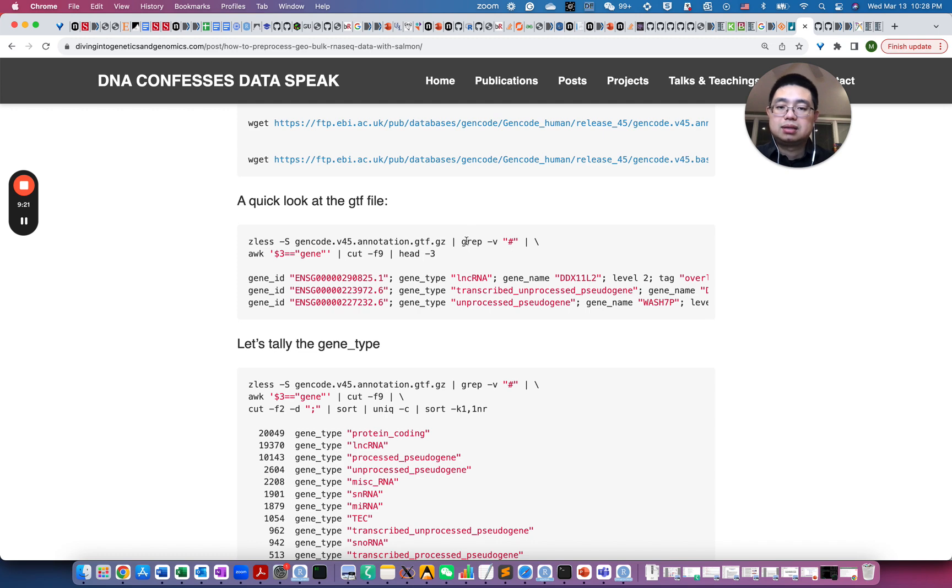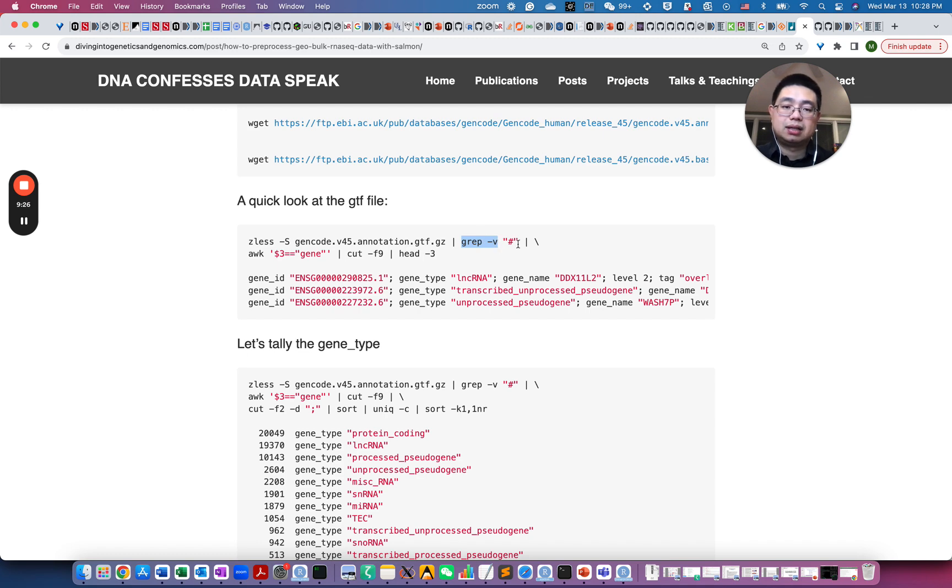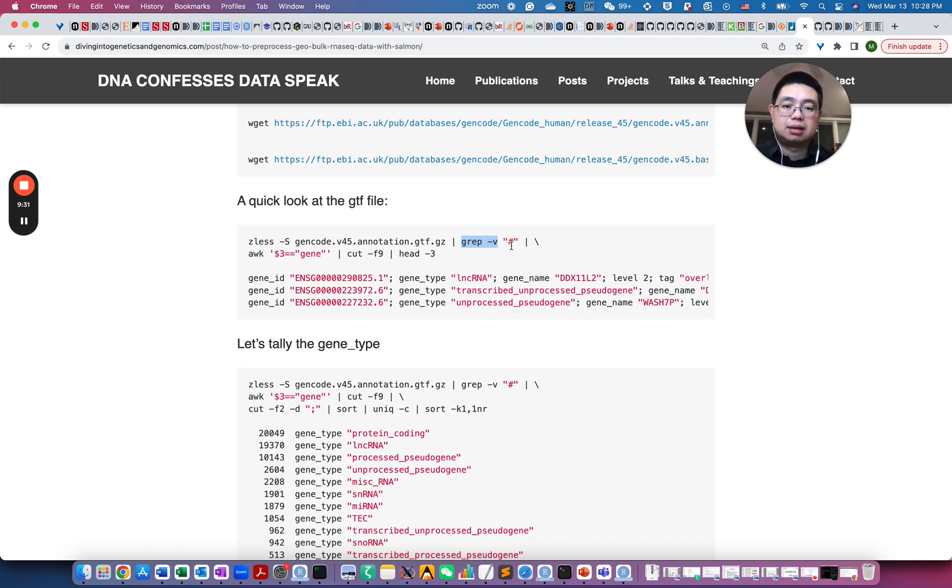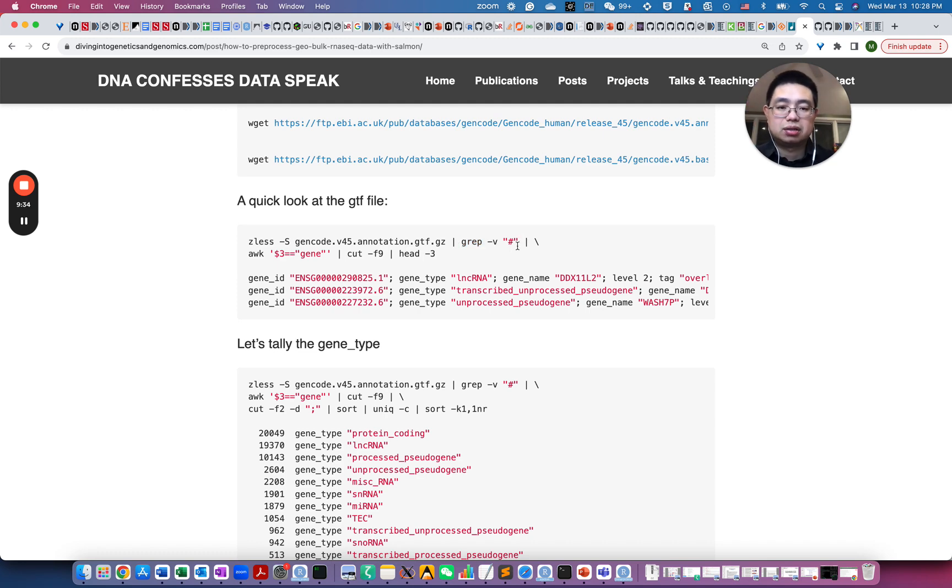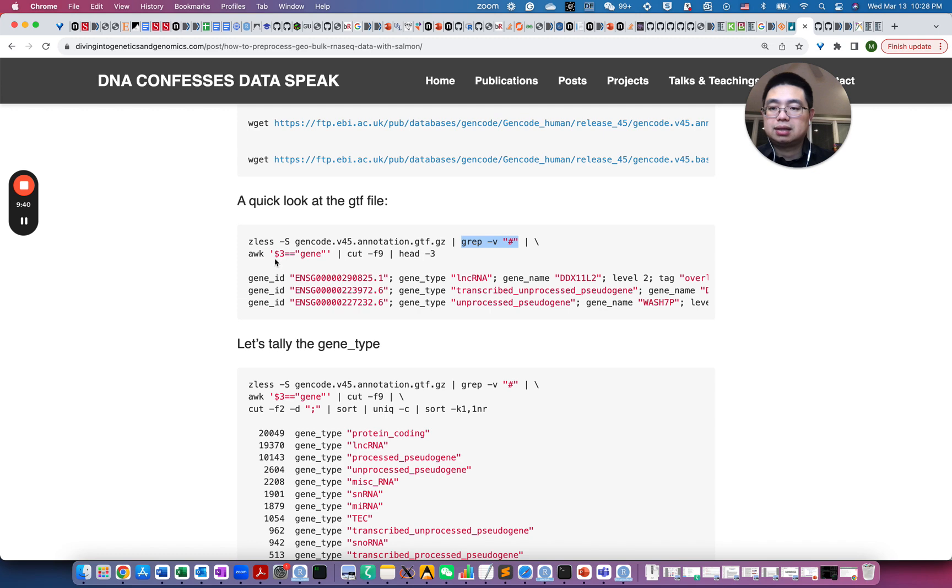And this is just some Unix commands to kind of look at the file content. So here in this example, I first grep -v this hash. So essentially, those are the comment lines in the front of the GTF file. So I will just remove them. So reverse pattern, so remove those comment lines.